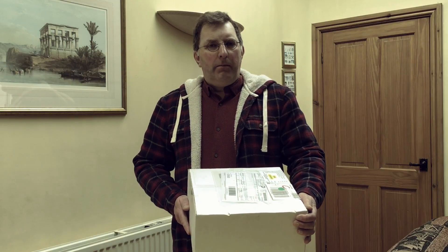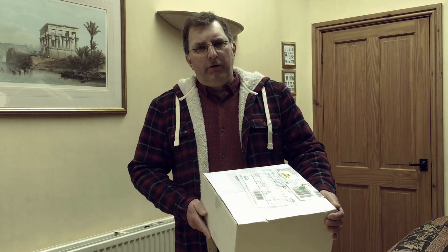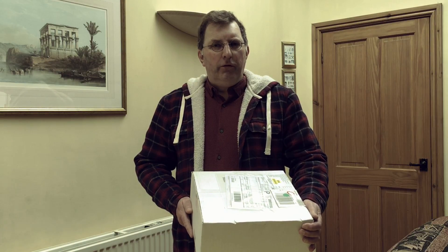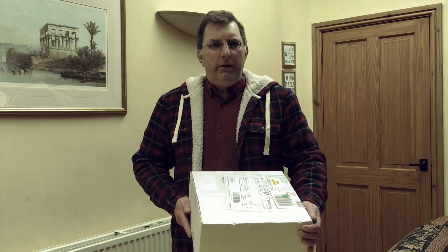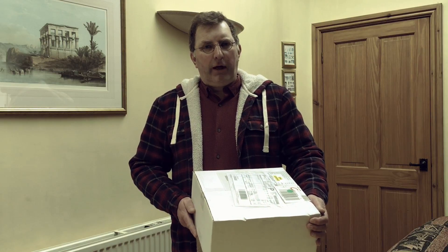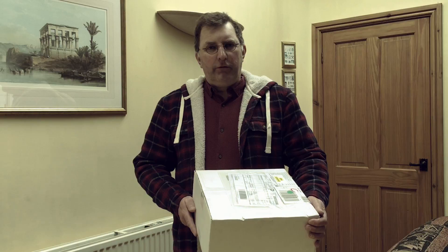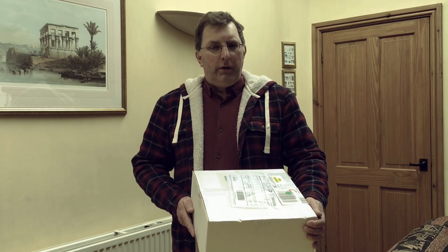The kit's taken a couple of months to arrive. Firstly, they said they were inundated with orders and had to move to bigger premises, and then it was two weeks in transit, mainly because it was stuck at UK Customs for several days, and I was a bit worried it wouldn't get through.